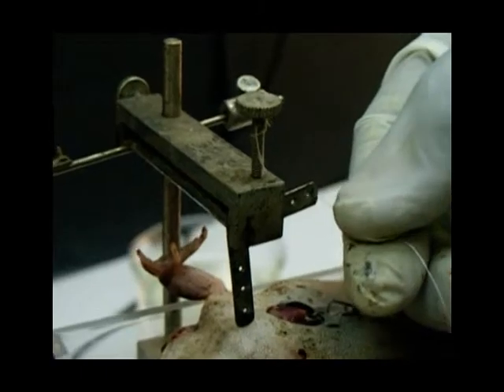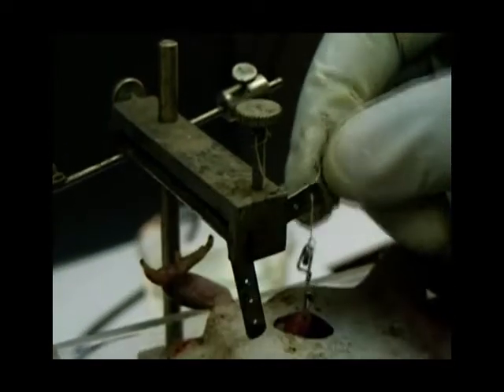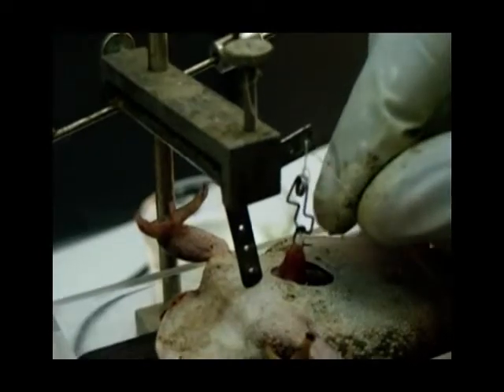The isolated frog heart preparation is mounted on the frog board. The hook is attached by a piece of cotton to a transducer suspended vertically above the heart.